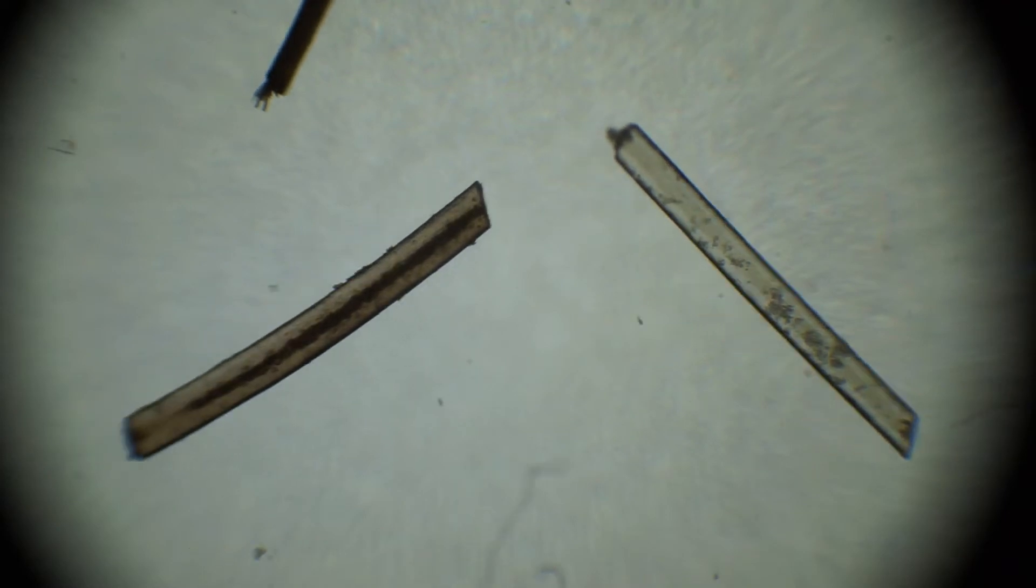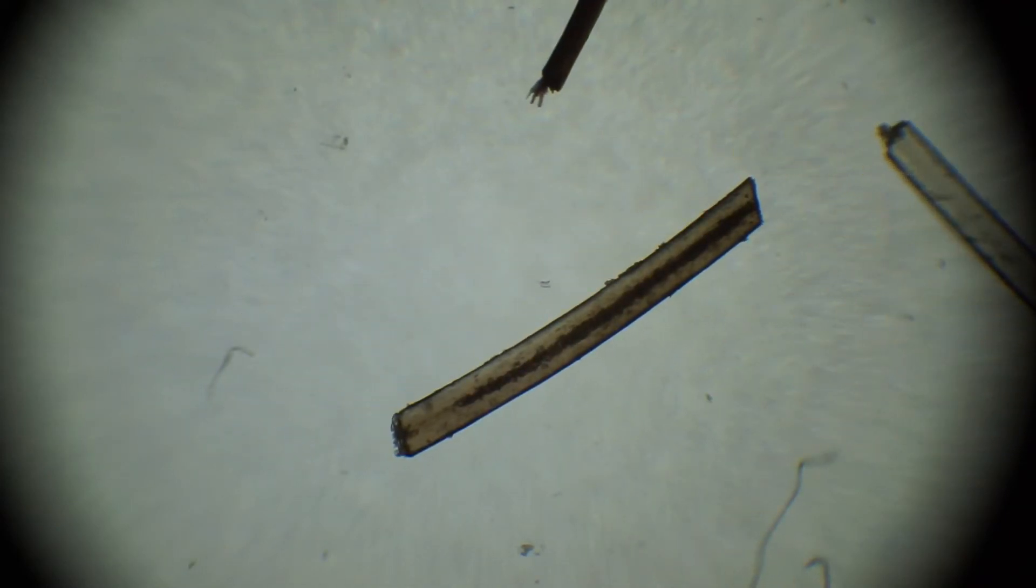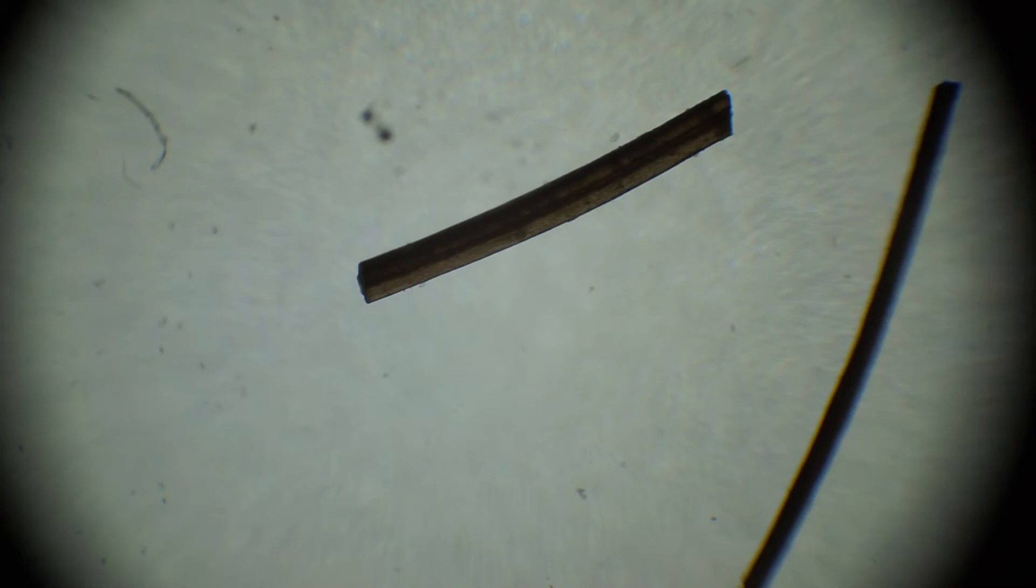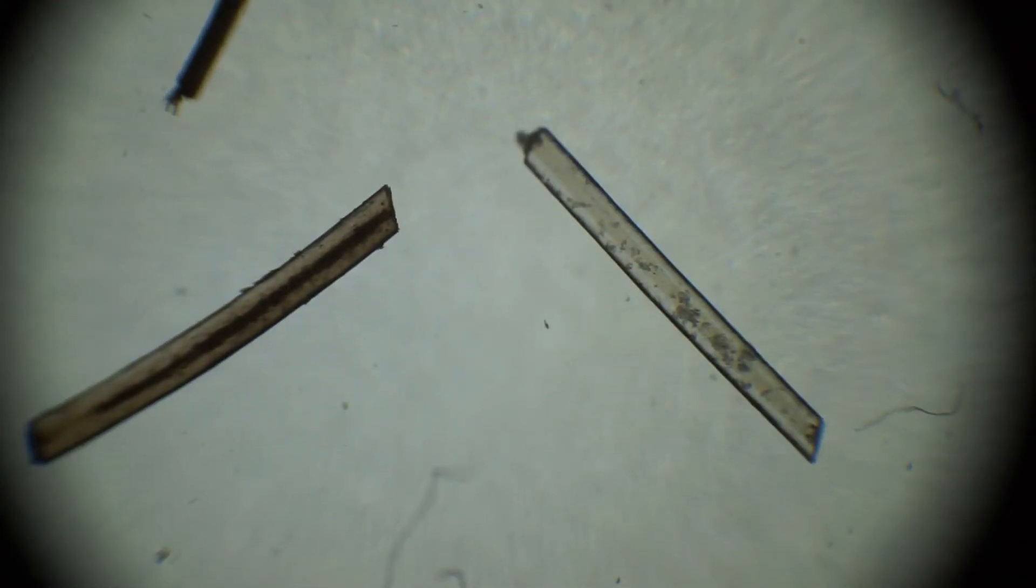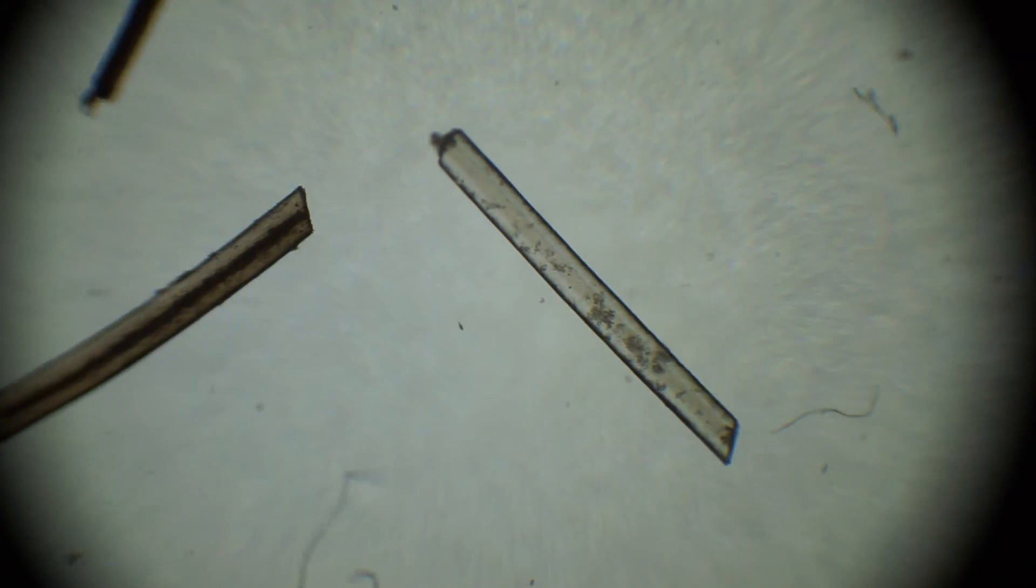And here we start at the four times ocular. The two dark ones, the dark brown and the black one to the right here. This one we will not take a so close look at, but we will take a closer look at these two because we can see through it a little.